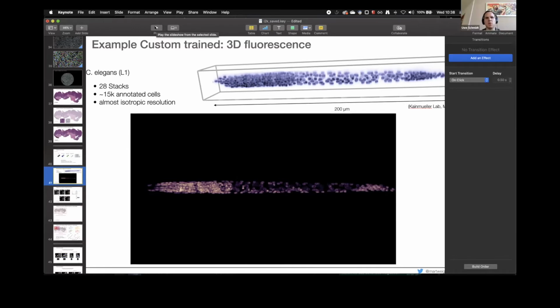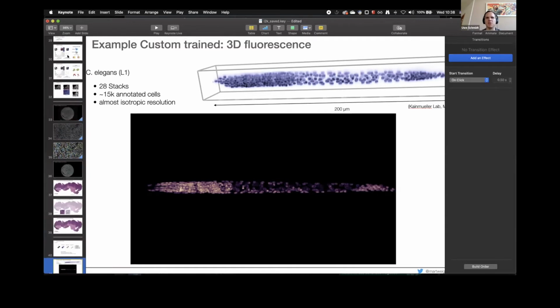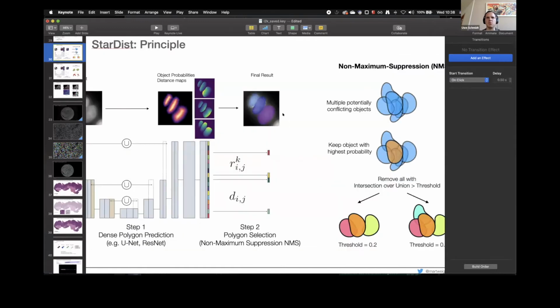If it's really a 1, 2, 3 pixel difference between including or not including the membrane, then maybe you shouldn't rely on this being super accurate, especially since we always have these rounded shapes that get predicted. So the shape fidelity on the borders is not super high. In general, I would not rely on the missing space between two predicted nuclei being super accurate.